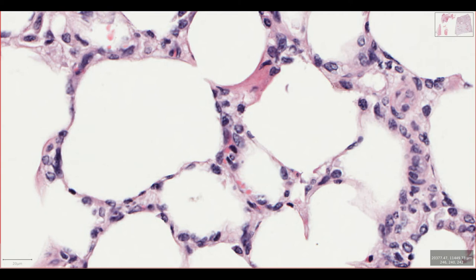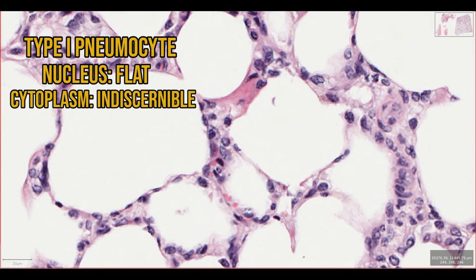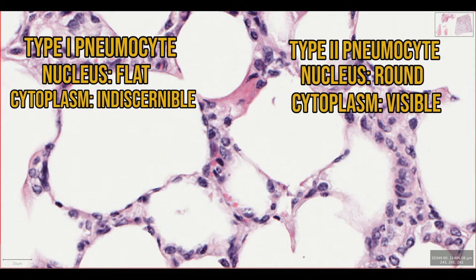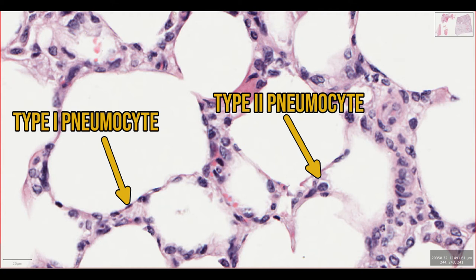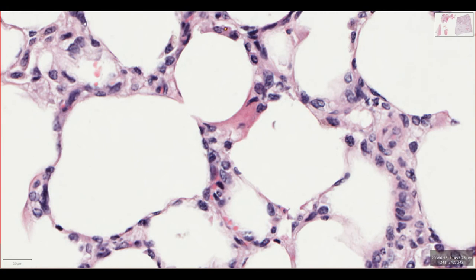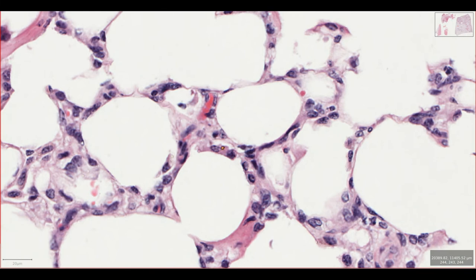My rule of thumb is to look at the nuclei and cytoplasm. A small flat nucleus with indiscernible cytoplasm is likely to belong to a type 1 pneumocyte, and a rounder nucleus with more cytoplasm is probably a type 2 pneumocyte. Underneath the epithelium there is minimal connective tissue with a few fibrocytes which surround the blood vessels. The blood vessels in alveolar walls are capillaries which can fit only a single red blood cell through at a time. In this section it's quite difficult to appreciate any blood vessels at all.